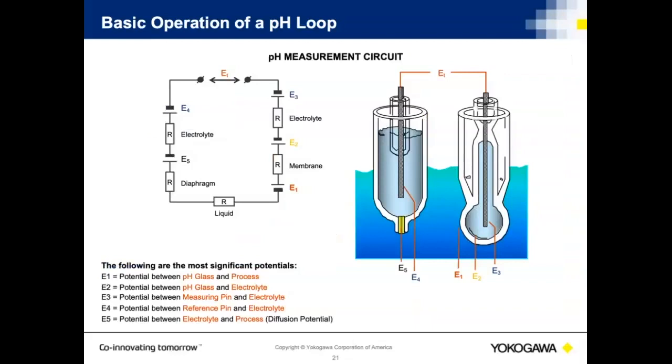That's the point of high purity water, to have as pure water going to a boiler system or being used in a semiconductor application, to make sure that we're not transferring different compounds into boiler components as they're boiled, such as in your tea kettle, or transferring different deposits onto a semiconductor in the case of the semiconductor industry.